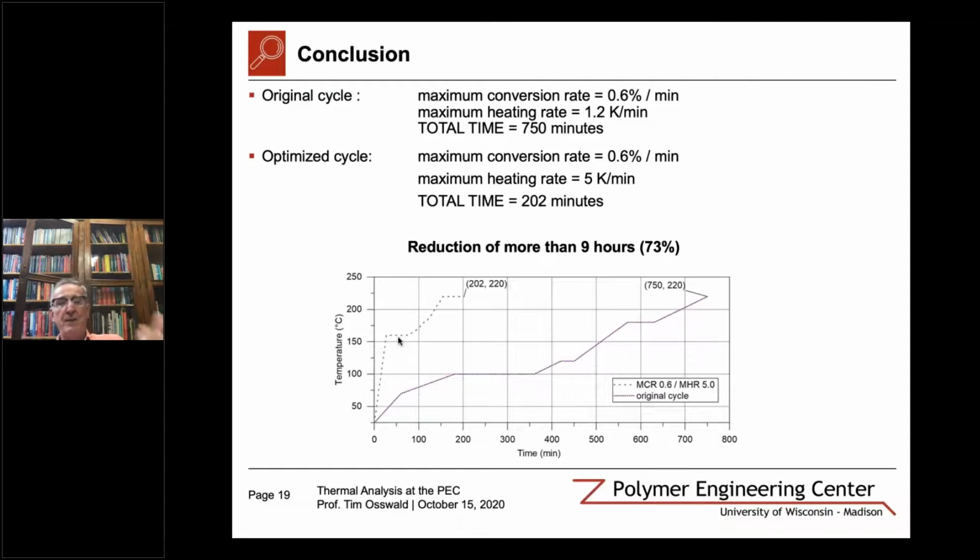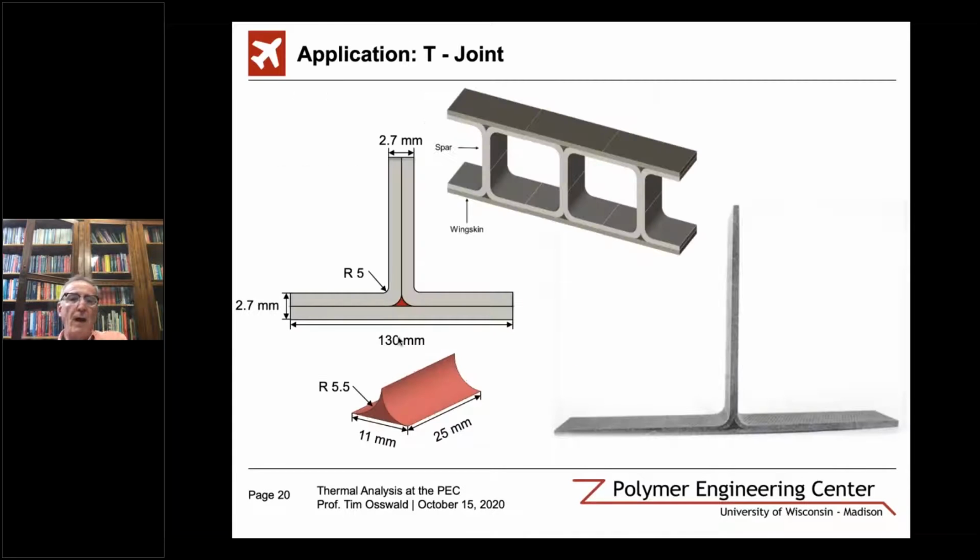Critical here is having accurate differential scanning calorimetry analysis with this software that can actually predict the reaction rate. And why do we need this? For example, we are using these materials, 3D printed with a Carbon system, to create hybrid structures.